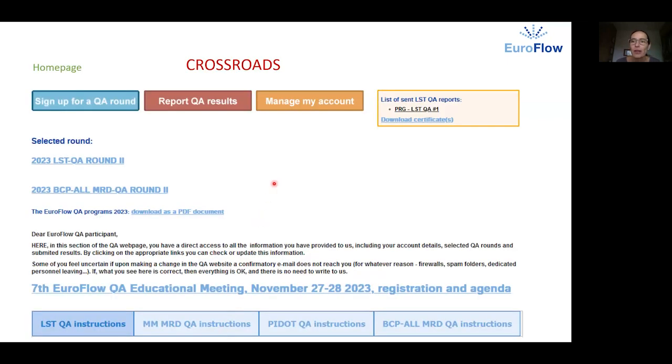When you log in the top of your home page looks like this. It is like a crossroads where you can use the links to get to the tasks you need. You can download a PDF describing the programs for the particular year. You can read the instructions for the individual QA schemes and when you decide you want to sign up for a particular round of your interest. You click on the sign up for a QA round link.